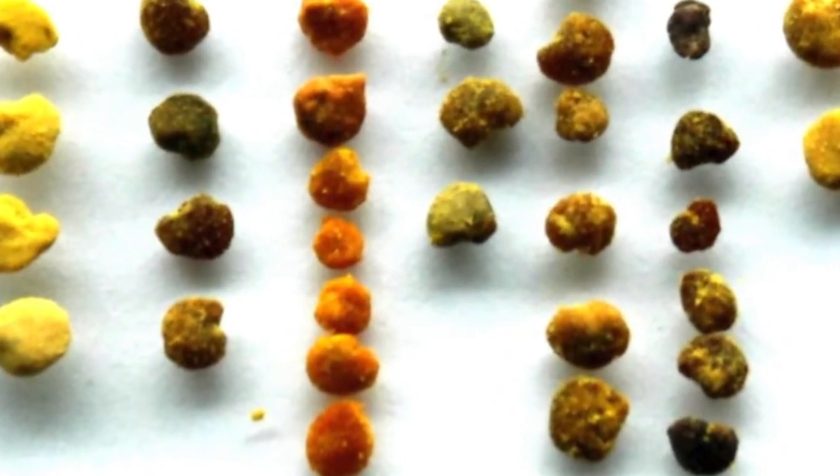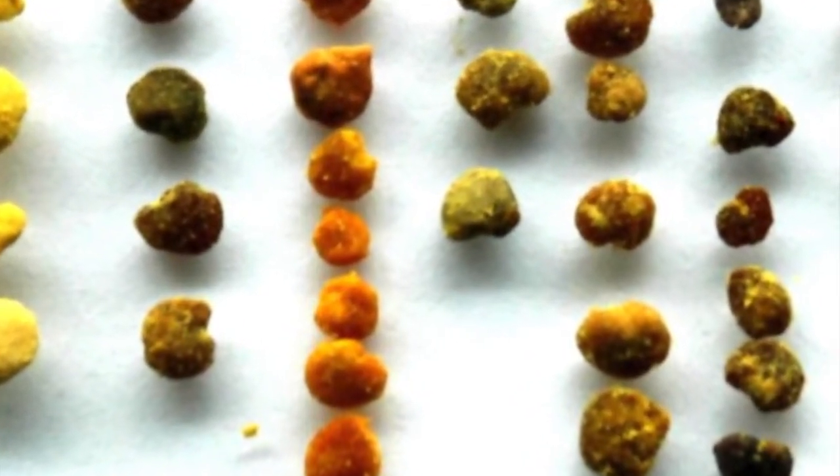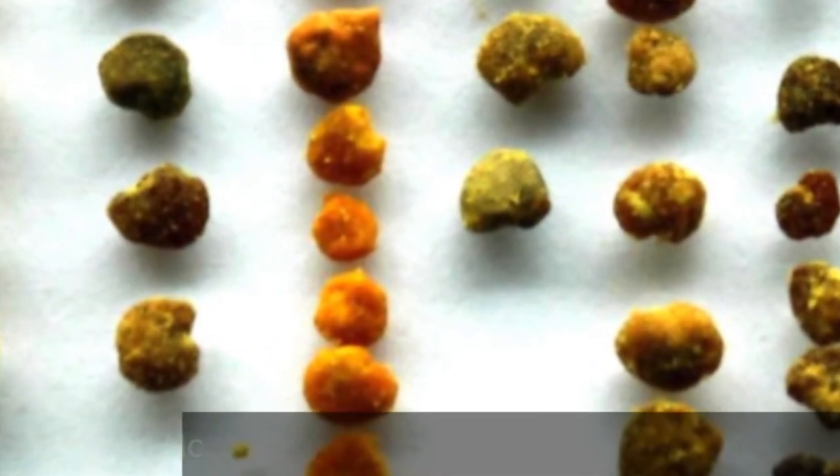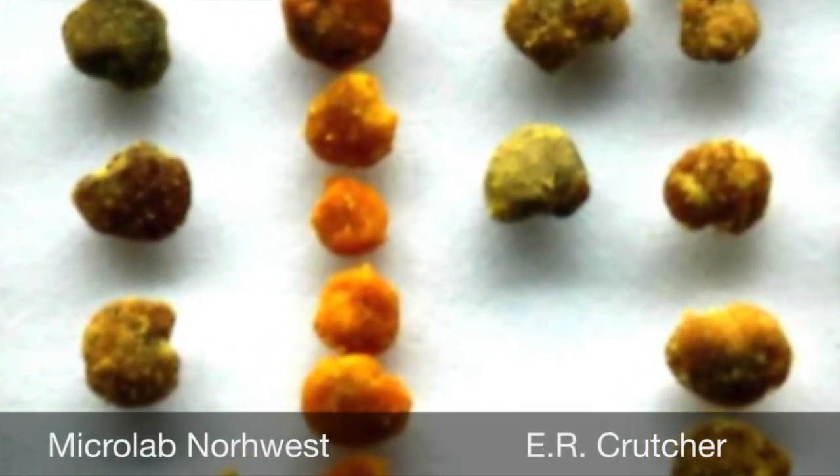That's all we'll look at here in the first row. Let's go now to the third row, which are the orange pollen packets in this particular set. And we'll look at those in the next episode.